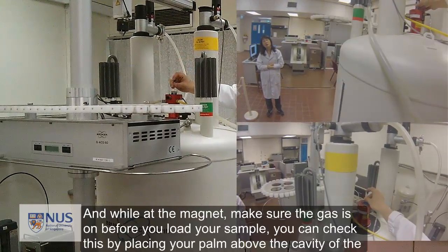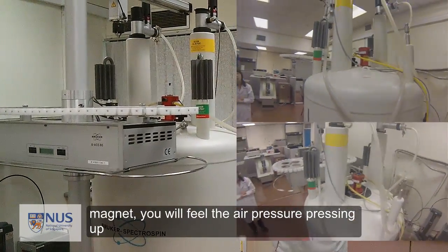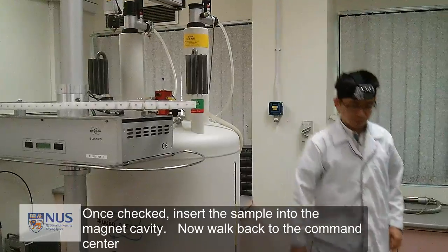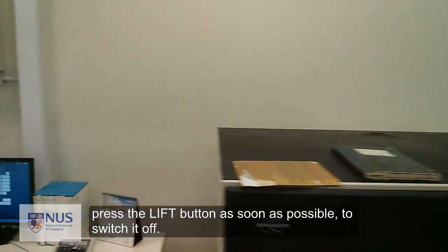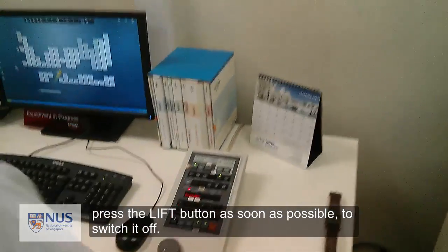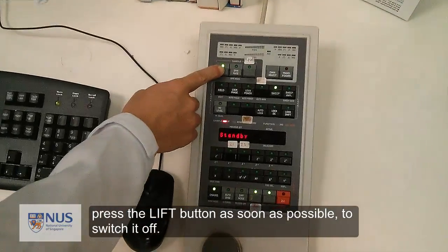While at the magnet, make sure that the gas is on before you load your sample. You can check this by placing your palm right above the cavity of the magnet. Once checked, insert the sample into the magnet cavity. Now walk back to the command center and press the lift button as soon as possible to switch it off.